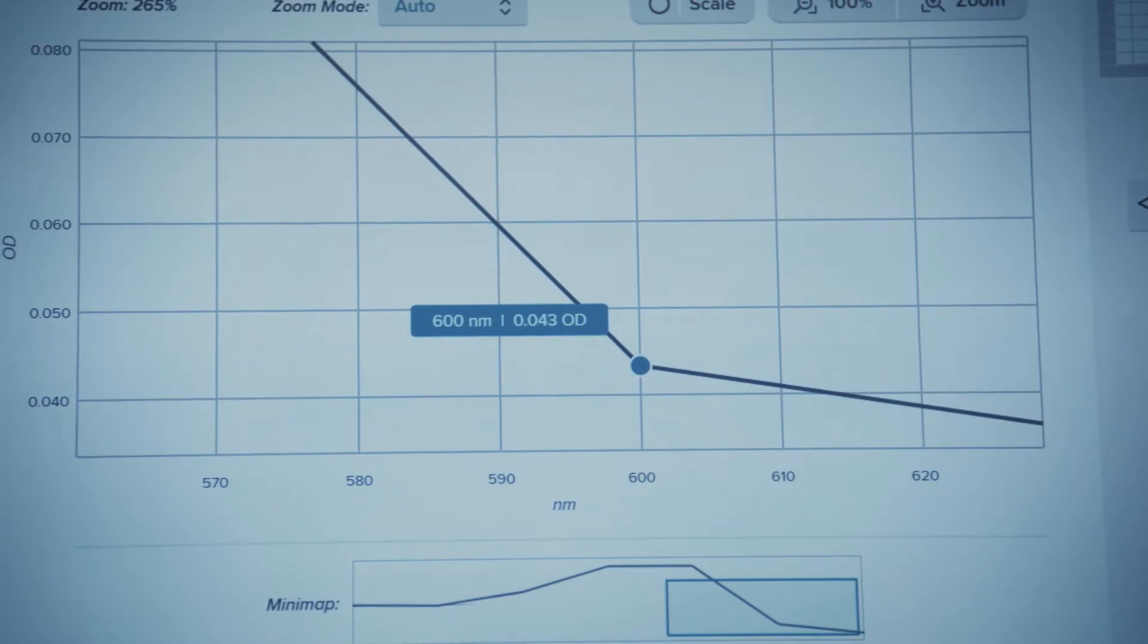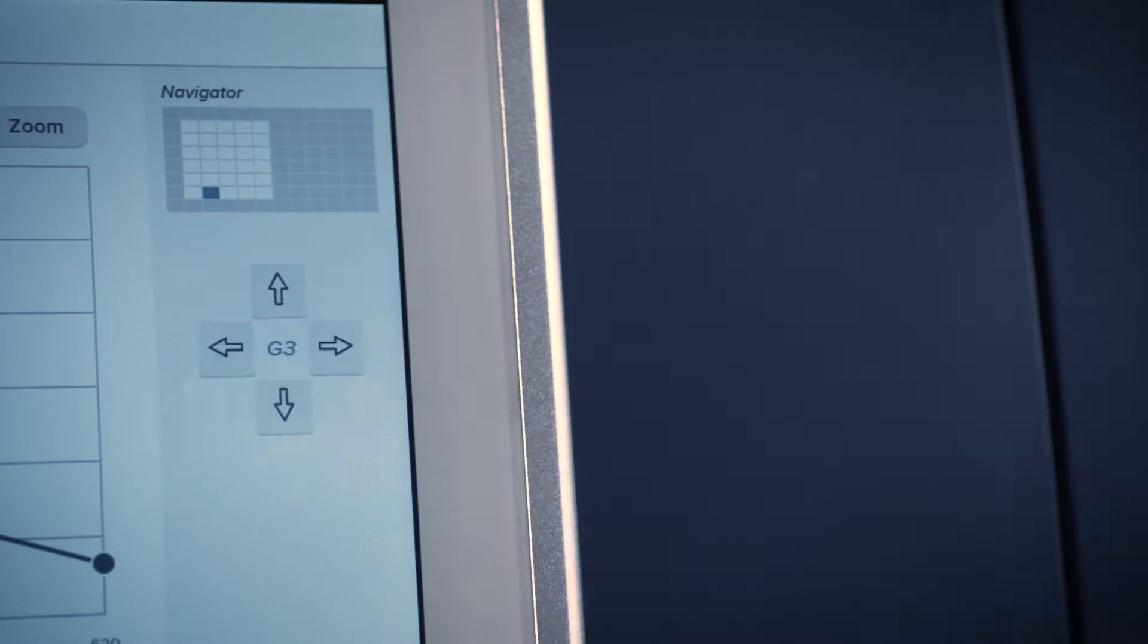Touching a graph point will display the numerical values plotted. Use the arrows to the right of the graph to navigate between wells.